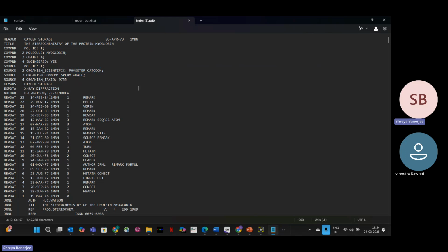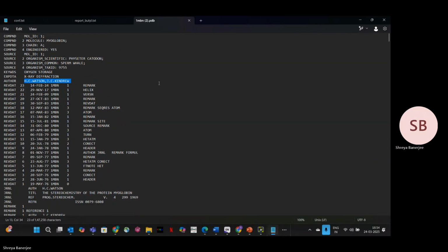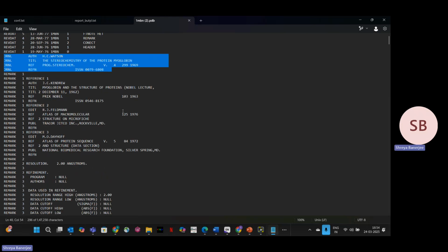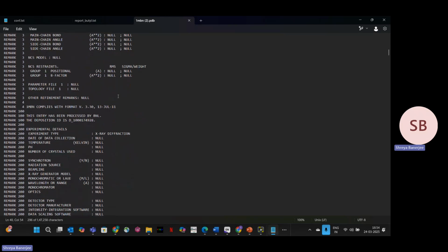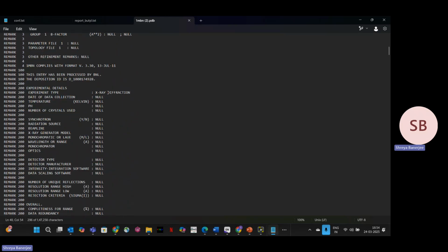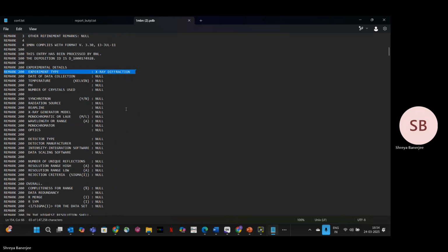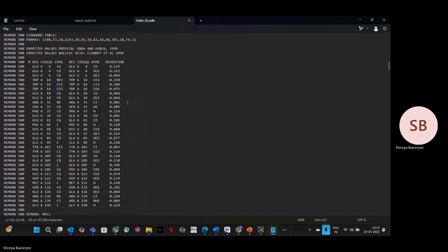You also have the details of the author and publication where it was deposited. So you see, in these 4 lines where it is written JRNL, it stands for journal, you have the author, the name of the paper, page number, and so on. And then there are different remarks about what kind of experiments have been done. You can see what experiment was done to determine this structure. It was X-ray diffraction. As you go down the structure, there are many other details I'll talk about.